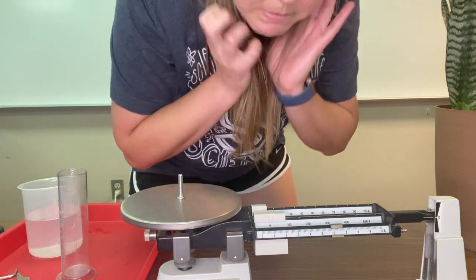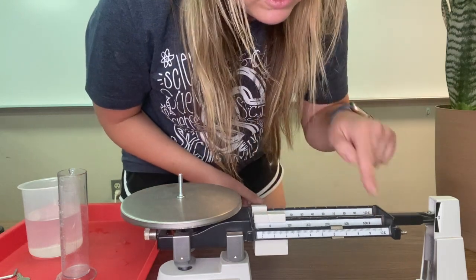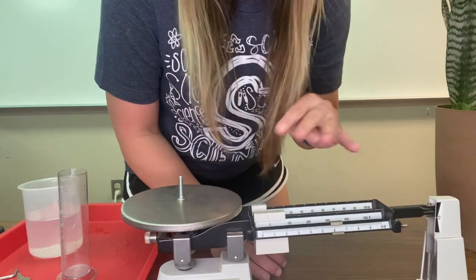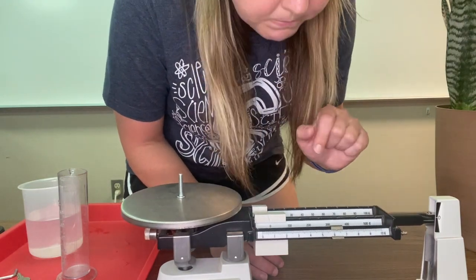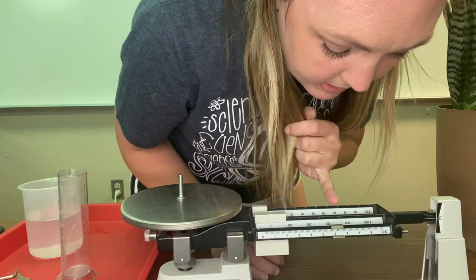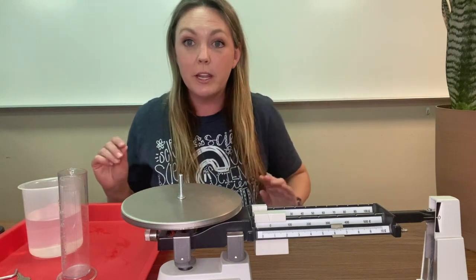Reading our triple beam balance: this smallest one goes from zero to 10, and in between there are 10 lines between each. So this one measures at six and two tenths grams — six and two tenths grams.